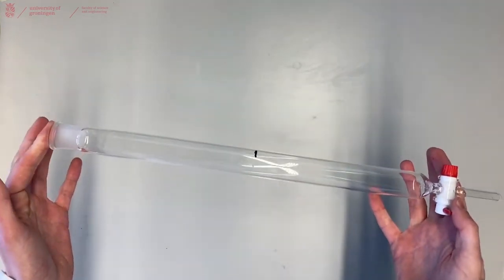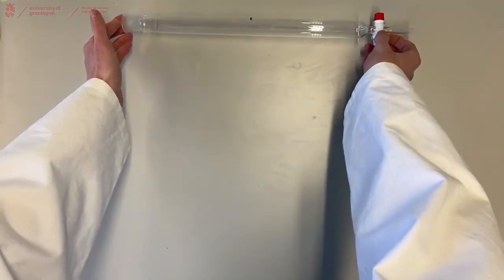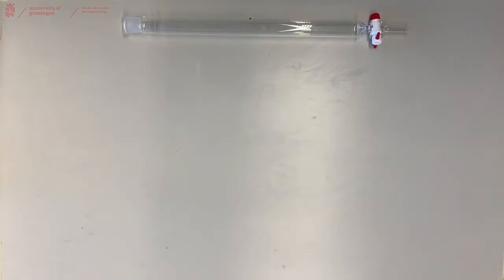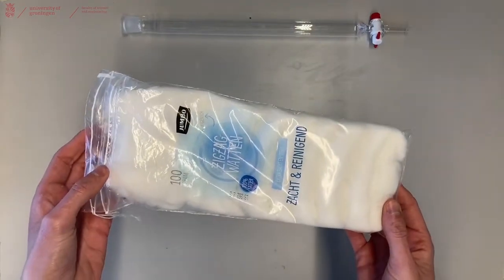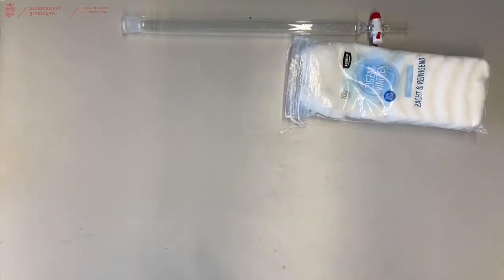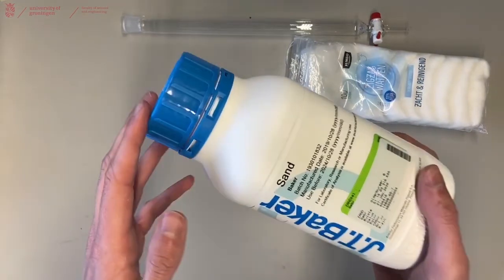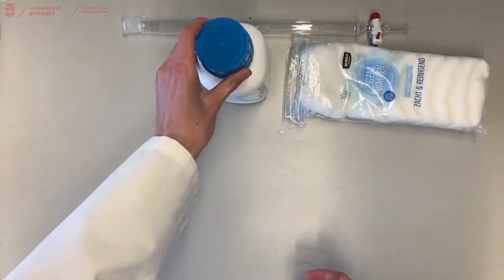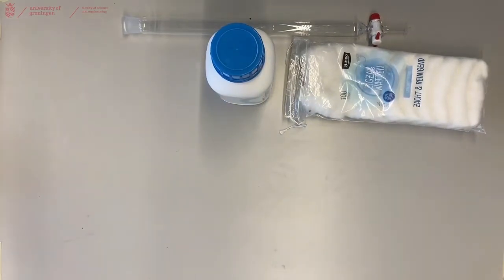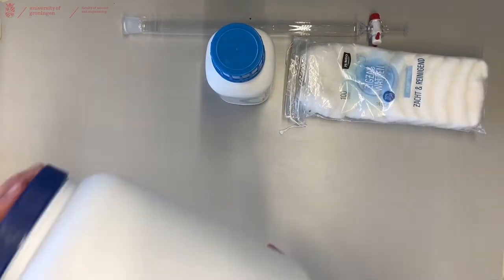First of all, you will need a column. In this column, you will have to fill with a couple of ingredients: some cotton, sand, and in this case we will use silica gel, but you can also do alox columns.